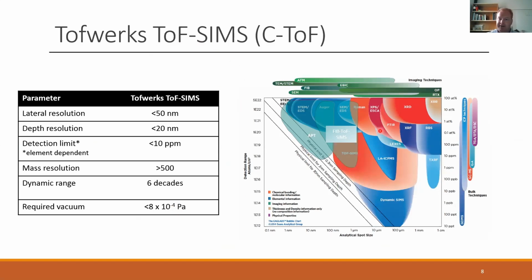Where we see this in this common schematic about different analytical techniques, we see ToF-SIMS as a technique that links some of the coarser analysis, such as laser ablation, with some of the very finer analysis, atom probe, TEM, and STEM, and so forth. So it's really nice that if you're preparing a sample for TEM, you can do your surface analysis maybe by EDS, but maybe that's a little bit too coarse. If you do ToF-SIMS, that helps to correlate that information right down to the nanometer length scale, which you'll be using with TEM or atom probe.